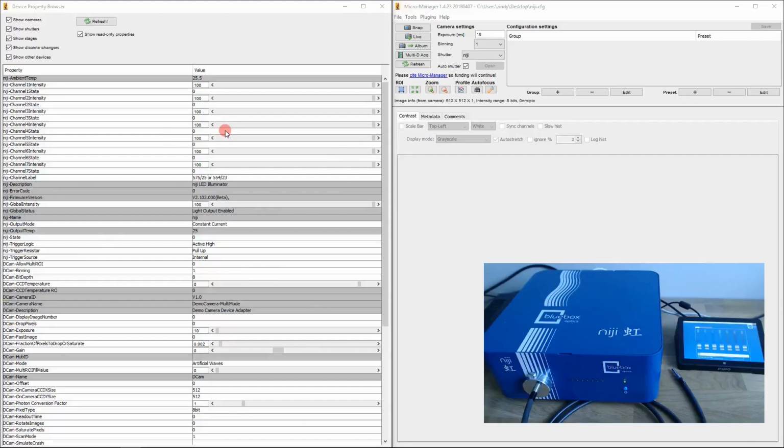Two things we want to control from Micromanager is which channel is on and at what intensity. So if we want to switch a single channel on at a time, we have the channel label. So this will select one state at a time. Or we can set the individual channels on and off in a preset.